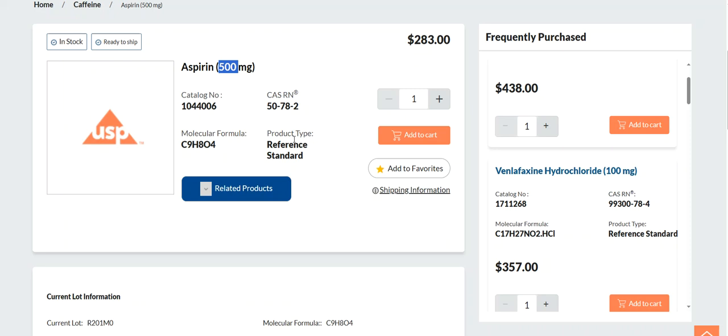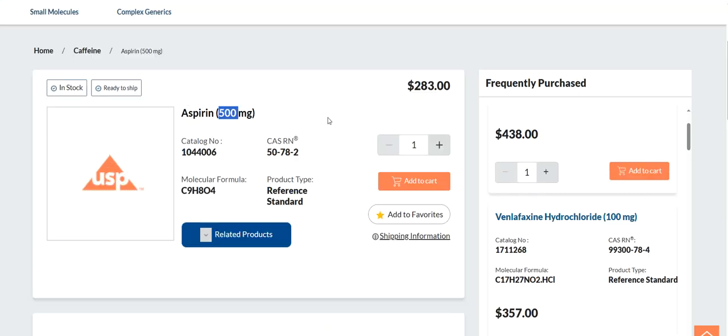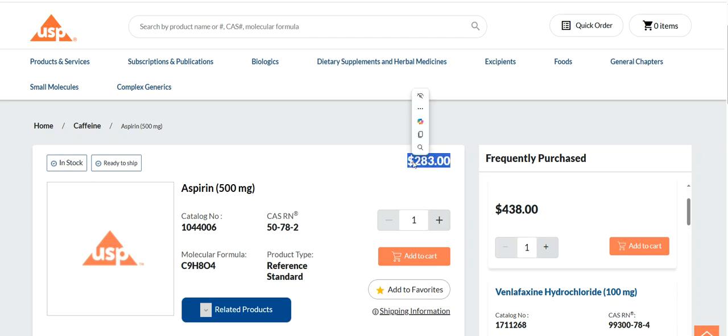But it is that expensive because these are very high purity reagents that we are using in a lab. And they have to go under scrutiny all over the place in order to get that USP approval. So when you get these, you know that you are using USP grade material in the testing portion of the laboratory procedures. And this gives you the standards to go by in order to compare your results to what they would classify as a standard result. So it gives you an idea of the money that is tied up in the standards that we begin to use in these monographs and in the testing on a daily basis.